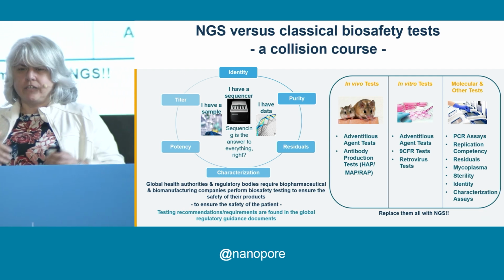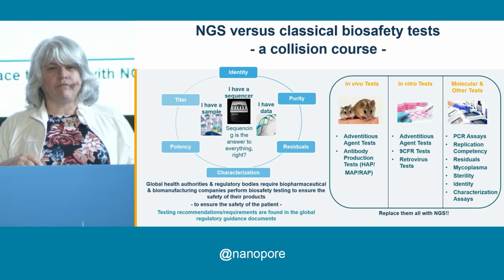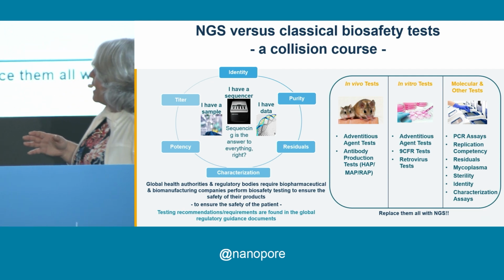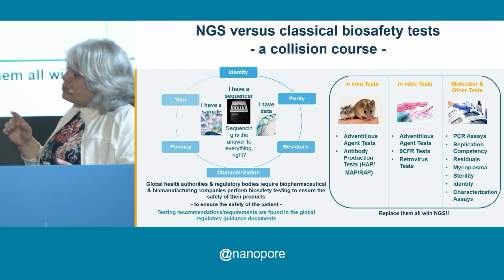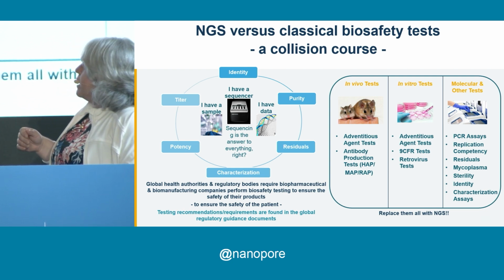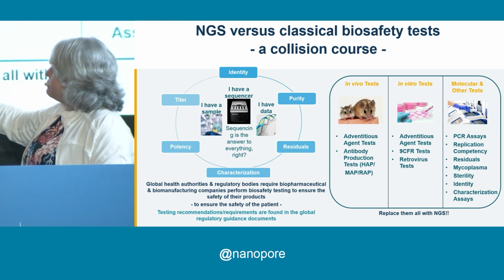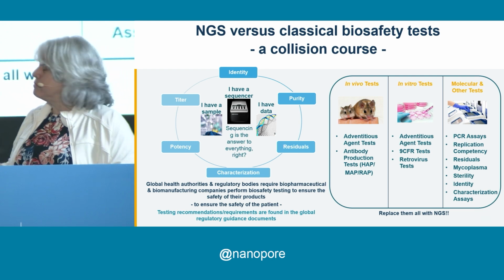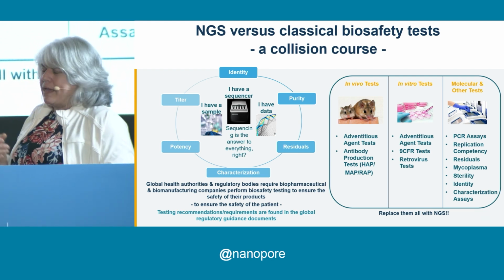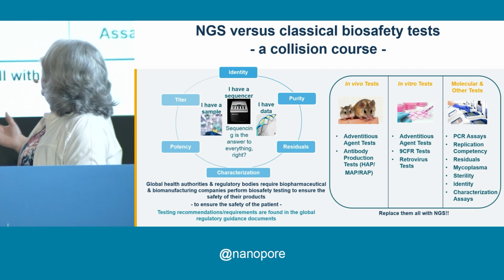So they just said, well, we want you to do this, but we're going to hold your feet to the fire, and we're not going to tell you how to do it, but we really want you to do this. And if you say no, they'll say, no, we're going to make you do this, and then you have to come up with ways to creatively do that. So we know that these testing recommendations are found in these global regulatory guidance documents. We have to follow them, but we're making our own way as to how we're going to follow them.